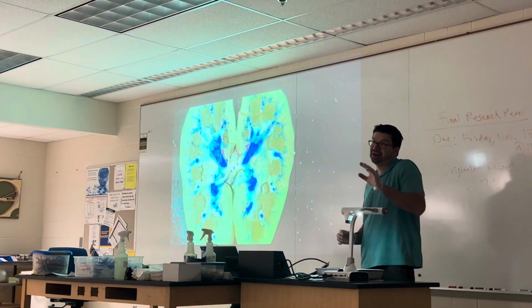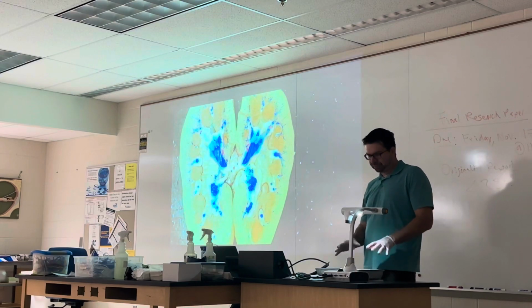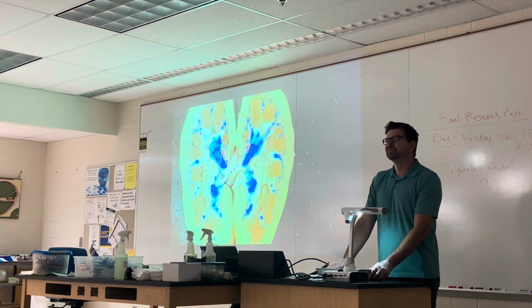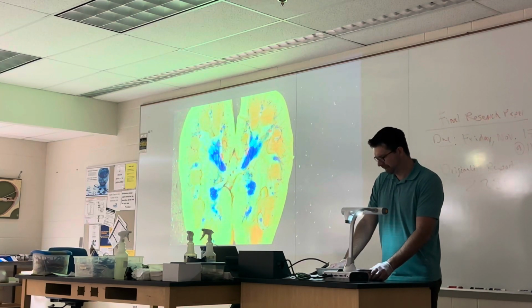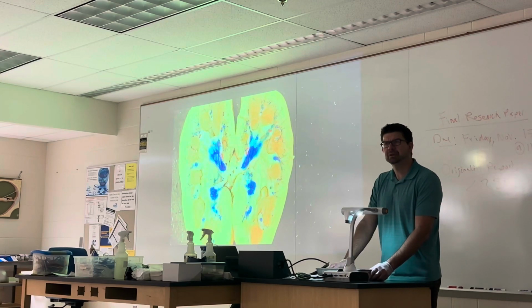There's probably some better examples hopefully back there for you to take a look at. But if you're feeling comfortable already, again, it's up to you if you want to get one out, but they are kind of fun. And I think all of them back there have already been cut, actually. I think I might have already cut all those. But you never know, there might be a couple here or there that can still be cut in half. Any questions about the pig kidney? You guys want me to go through it again, or are you guys getting a good gist of where all the parts are? I feel pretty good about it. Okay, everybody feeling pretty comfortable?